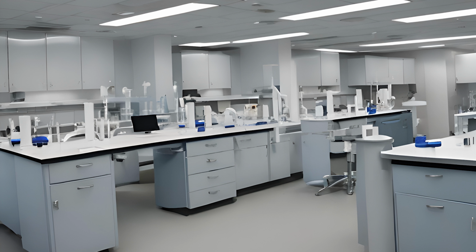You're also going to have a log for employee percutaneous injuries from sharp devices, such as needles or glass or anything like that.